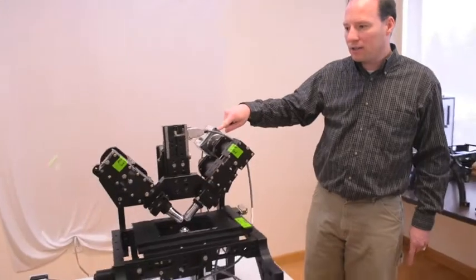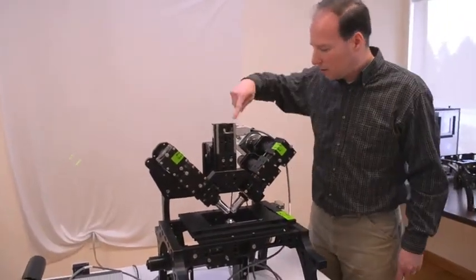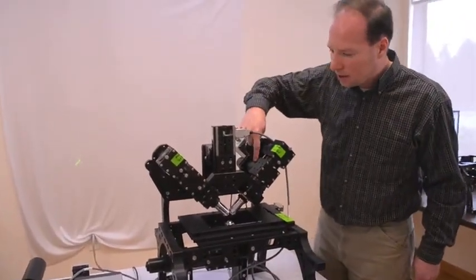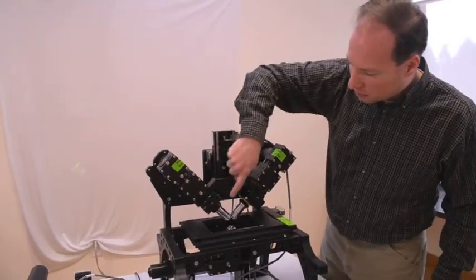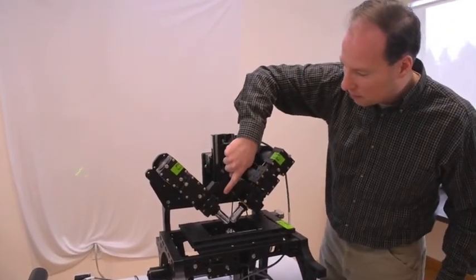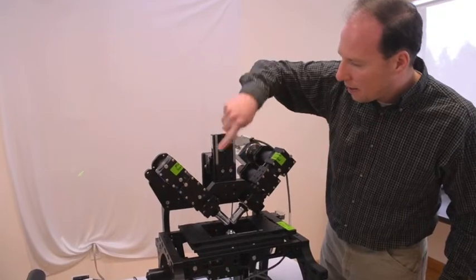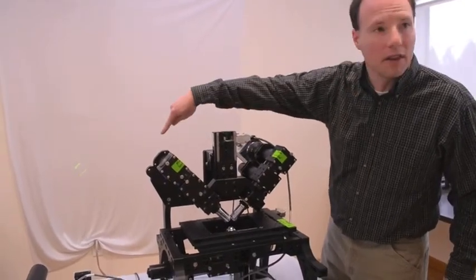The other imaging path is simply a mirror image, and it is not populated here. You'd have a scanner on the right side through the two objectives. The objective on the left would be used for imaging, and then you'd have a camera on the left side here.